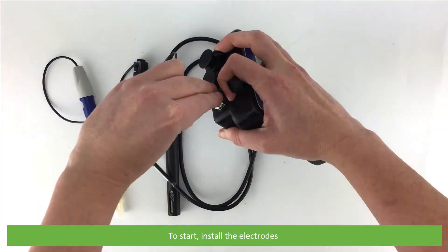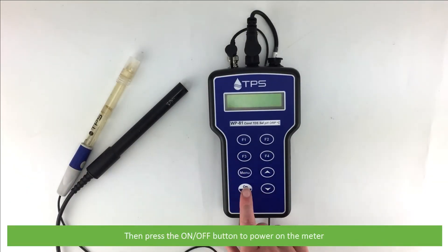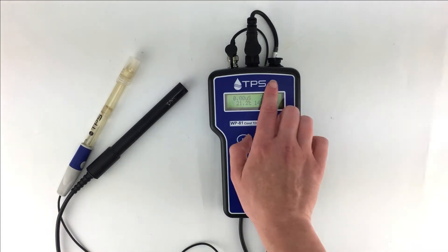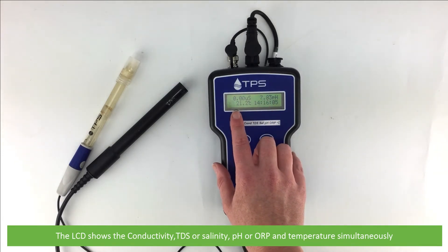To start, install the electrodes. Then press the on-off button to power on the meter. The LCD shows the conductivity, TDS, salinity, pH or ORP and temperature simultaneously.